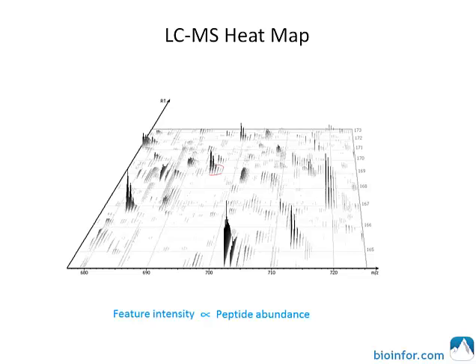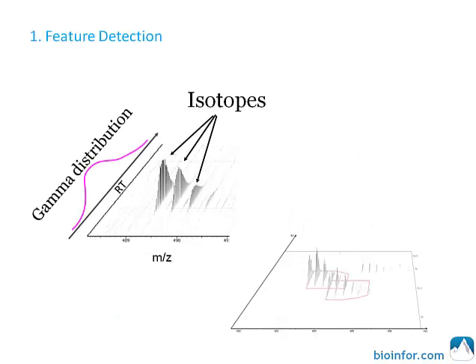The abundance ratio of a peptide between two samples can be estimated by the intensity ratio of the peptide feature in two heat maps. There are several steps to determine the relative abundance of a peptide and protein by label-free quantification.